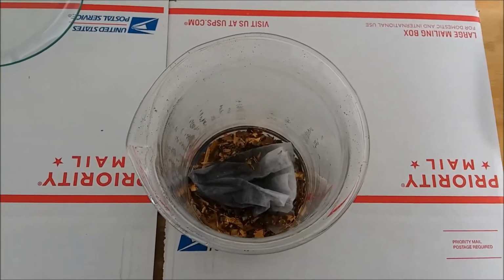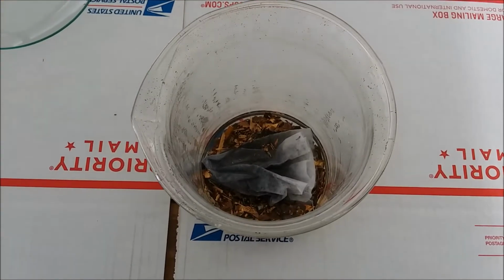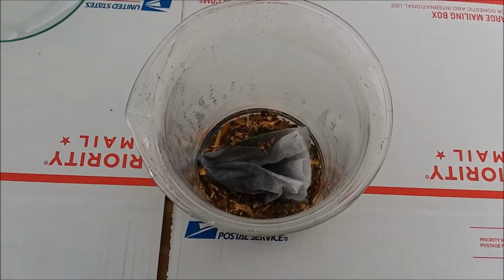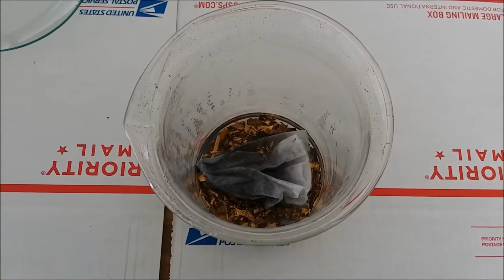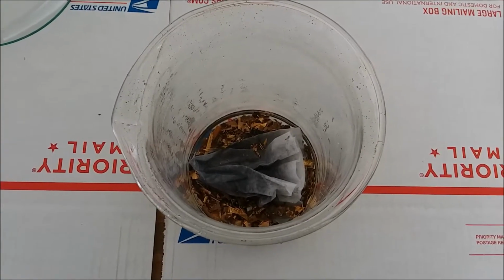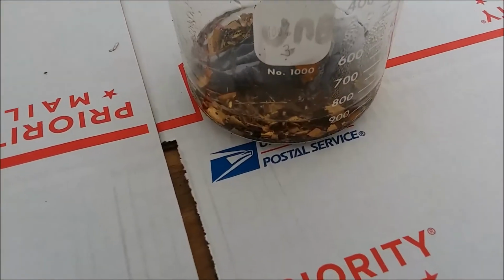Okay, it's the next day. I've got some time today. It's time to start dissolving this gold and purifying it. It's all in one beaker now, including the filter I used for filtering off the rinse water yesterday. The filter's loaded with gold too. So it's all in one beaker. A little bit of water in there.